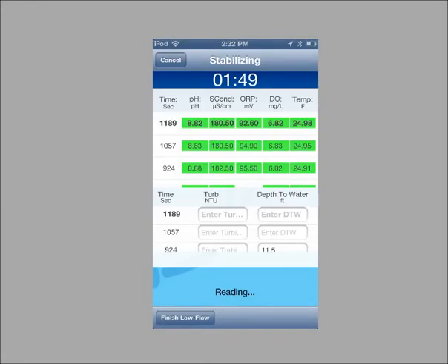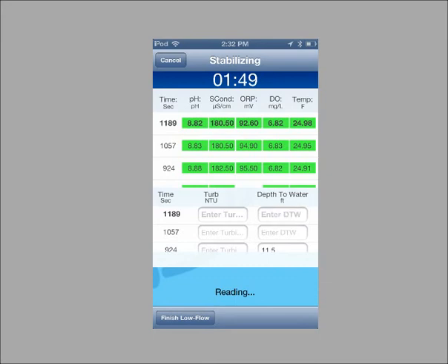The first sample interval will complete before you see data on the screen. You can enter the depth to water value for each reading as the test stabilizes.